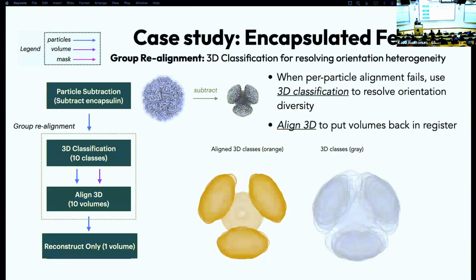So what are the advantages of doing this? Well, as we saw, 3D classification is, in this case, less prone to overfitting than local refinement, specifically because A, alignments are frozen, thus they're never estimated on a per particle basis, and B, it can create new classes, or rather it has more classes to work with. It doesn't have to force all particles to look like the same structure. Heterogeneous refinement and local refinement both attempt to estimate alignments on a per particle basis, and that can be problematic when there's still quite a bit of junk, and also when alignments are far from their true or optimal values.